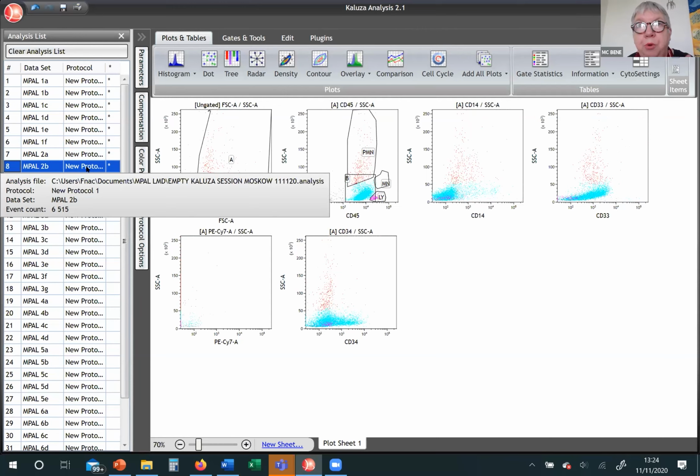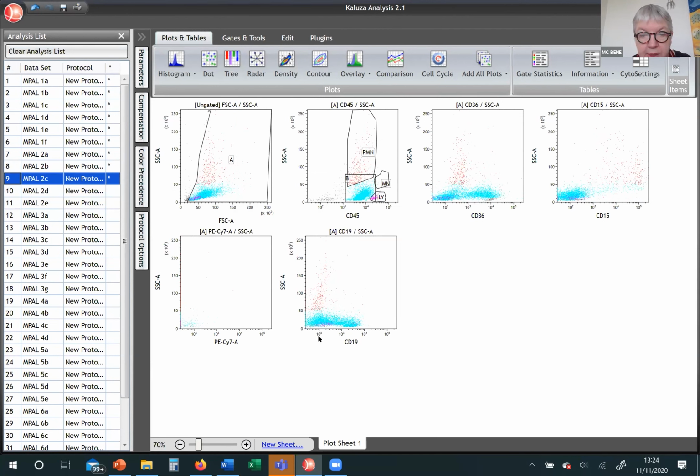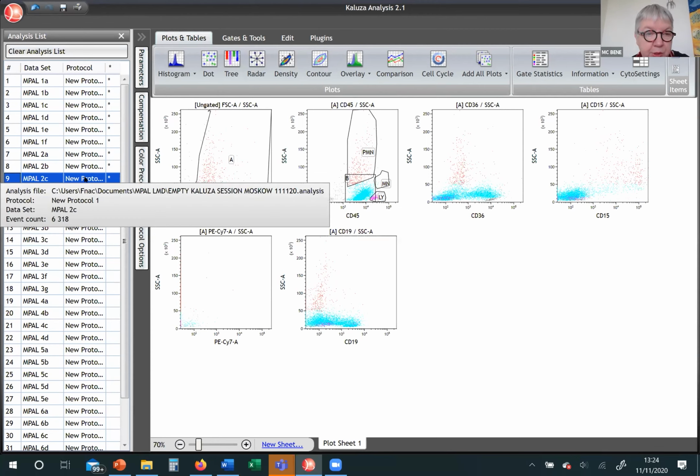There is a small population of normal growing cells that co-express CD7 and myeloid markers. So we go on and we have CD33, so we're still fully myeloid, partial expression of CD34, some CD36, and part here of CD19. You see that there are very few normal B cells here, purple, but part of the blast population is expressing CD19.